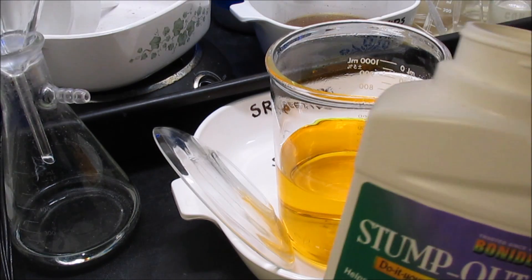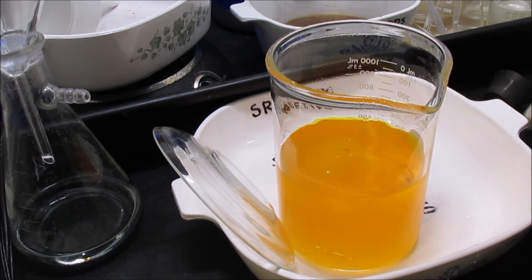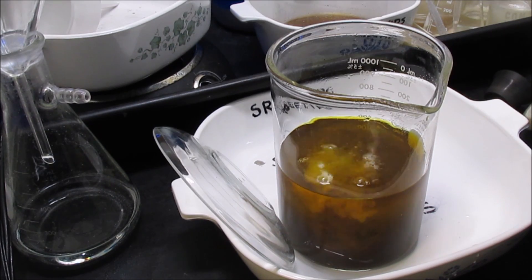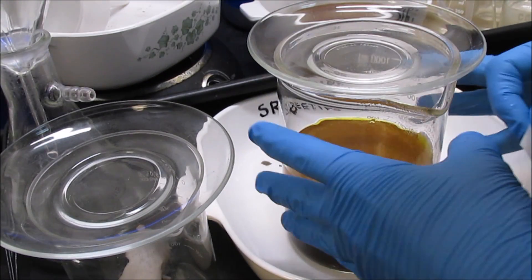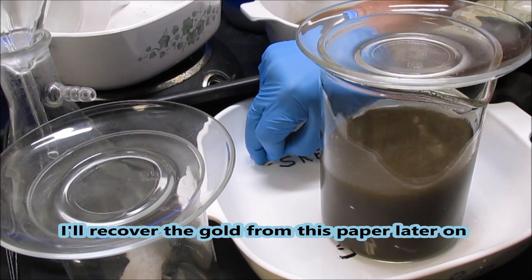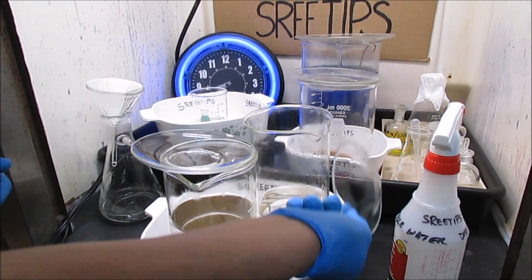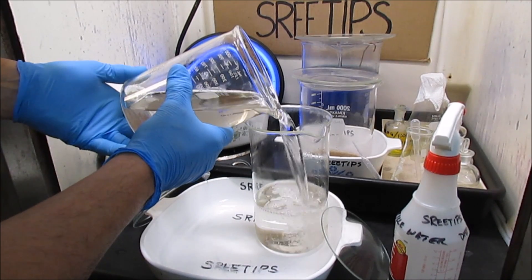Now I'll add some stump out and precipitate out the gold. A little bit of gold came out — I'm going to sop that up with a filter paper and add it to my papers. The gold has settled nicely. I'm going to go ahead and pour off the waste, then get this gold into a filter paper so we can melt it up and make a nice bar for the jeweler.